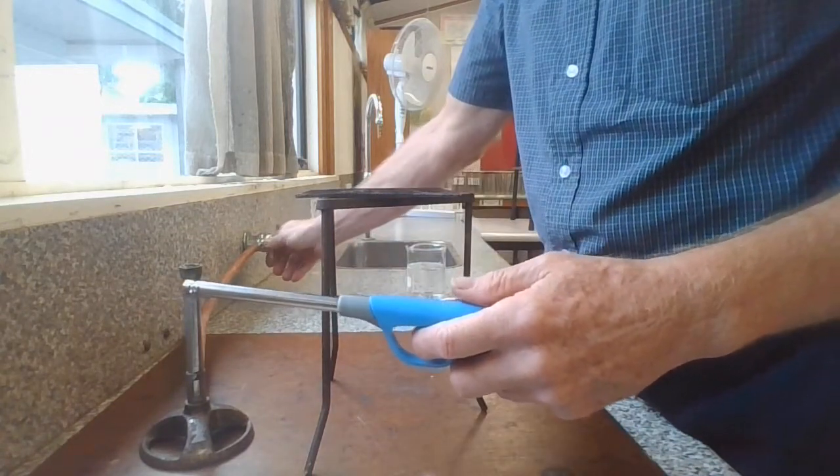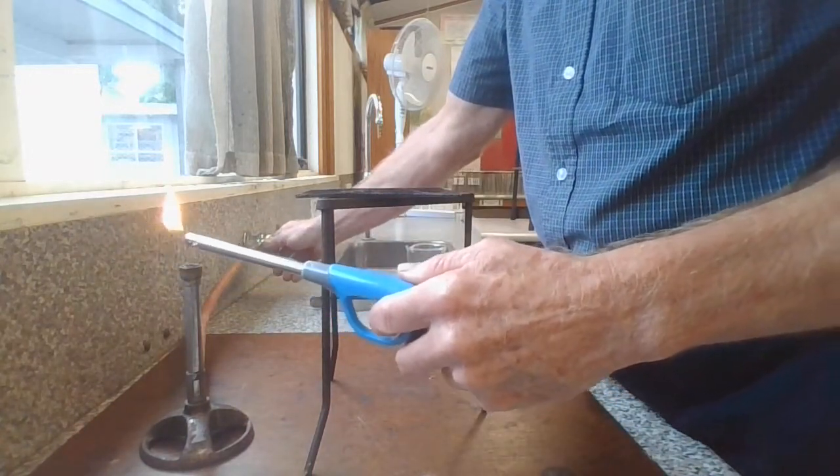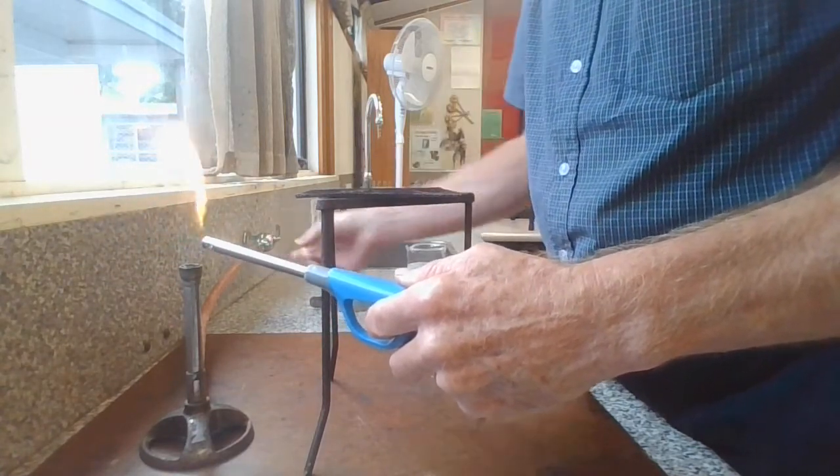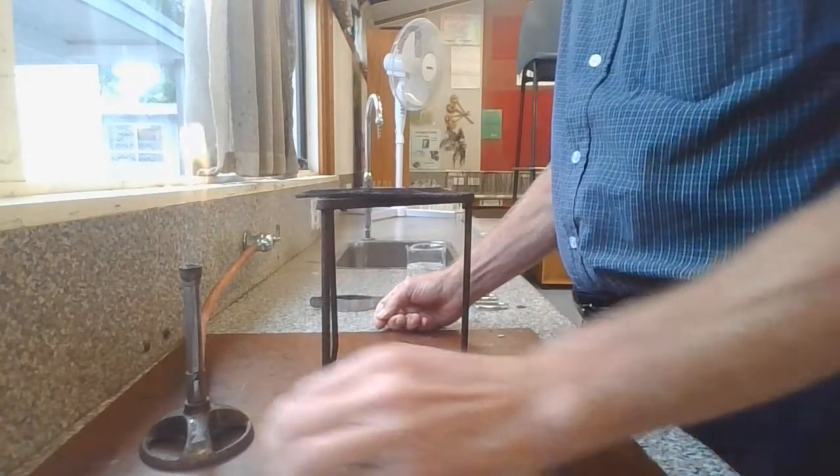Don't light the Bunsen while it's under the tripod. You need to remove the Bunsen from under the tripod to light it safely. Adjust your flame.